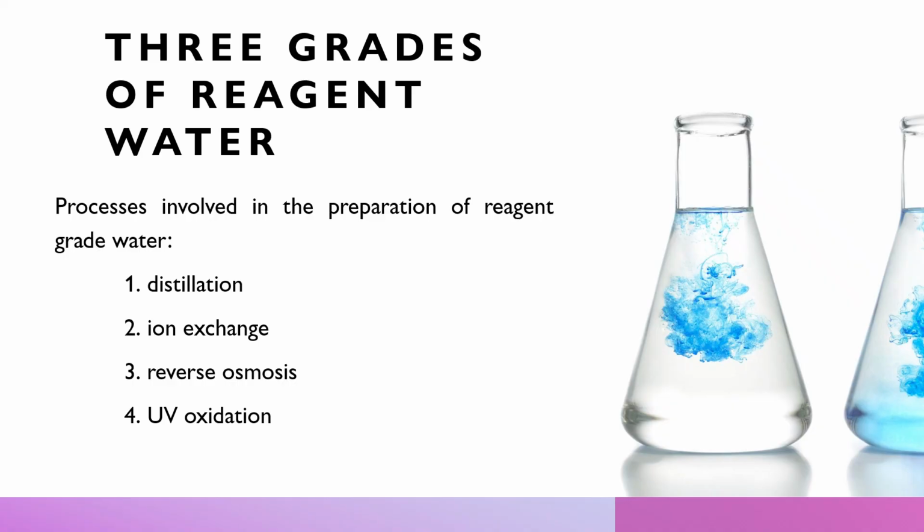According to the CLSI, or the Clinical and Laboratory Standards Institute, reagent grade water, class, is classified into 6 different categories based on the specifications needed for its use rather than the method of purification or preparation. So write down these 6 different categories that are set by the CLSI. Write it down. I'll say it one by one. The first category is called the clinical laboratory reagent water.